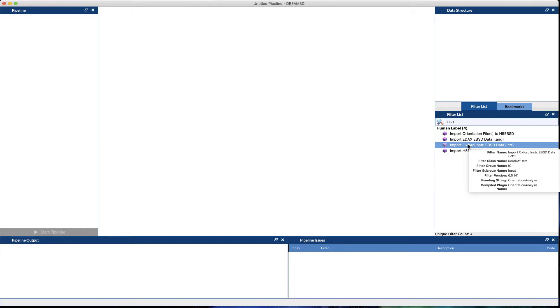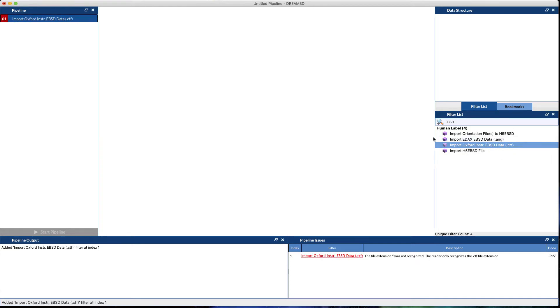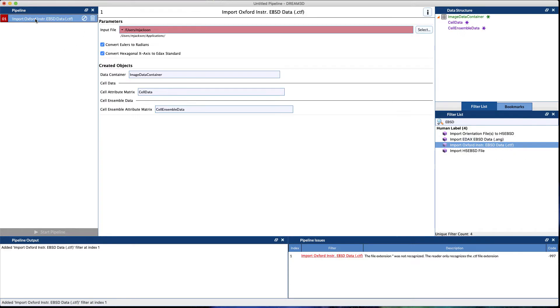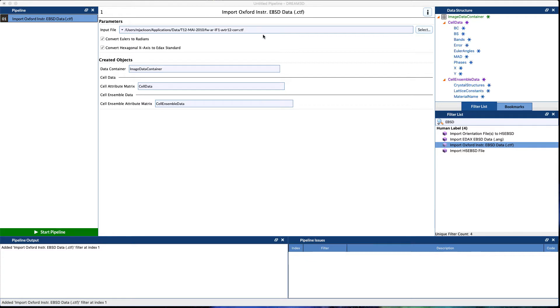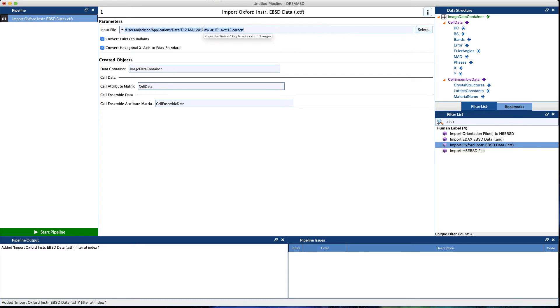We can either drag the filter or double-click the filter and it will be inserted into the pipeline at the bottom. For our input file, we have a couple ready to go and Dream3D does ship with some example data. We're going to use the T12 MAI-2010 dataset. You can use the select button or just type or paste the path in.